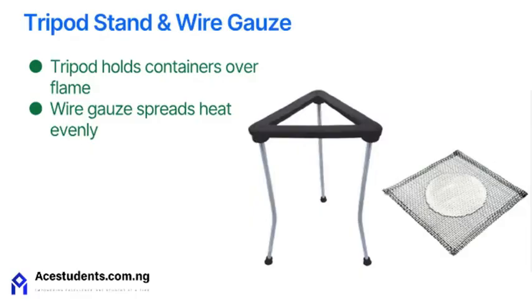Let's look at the tripod stand and wire gauze. The tripod stand holds containers above the Bunsen burner. A wire gauze is placed on top to spread the heat evenly.